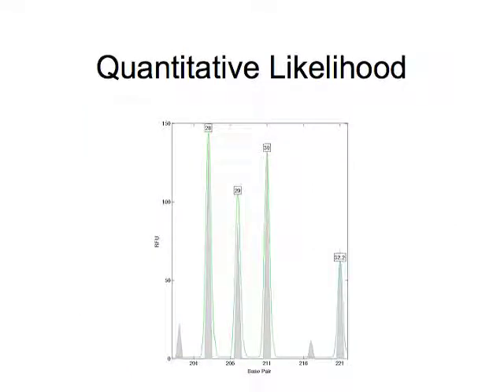Next slide. These expectations of the different amounts of contributors and what their alleles would be are reflected in quantitative data shown here in green. Now, a quantitative likelihood function is one shown here in gray that tries to model and account for and explain what the quantitative peaks are based on selecting different allele pairs for the genotypes along with other parameters such as mixture weight, quantity of DNA, stutter, and so on. We will be returning to this later on.